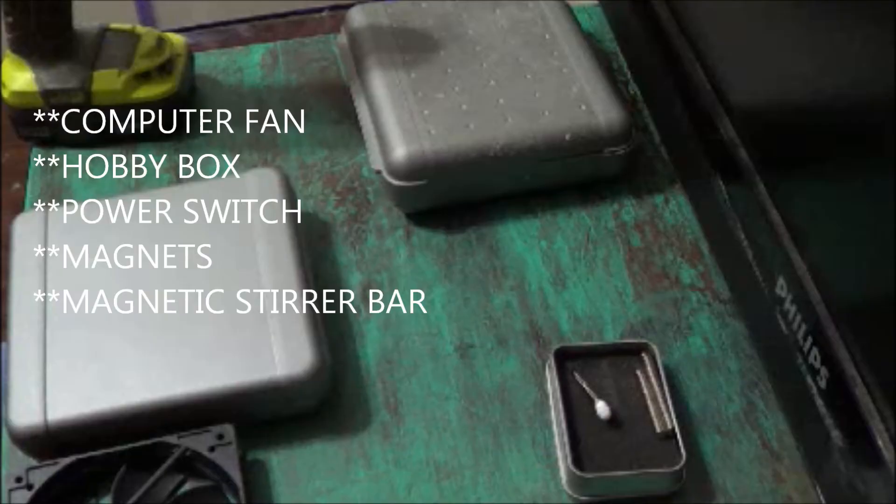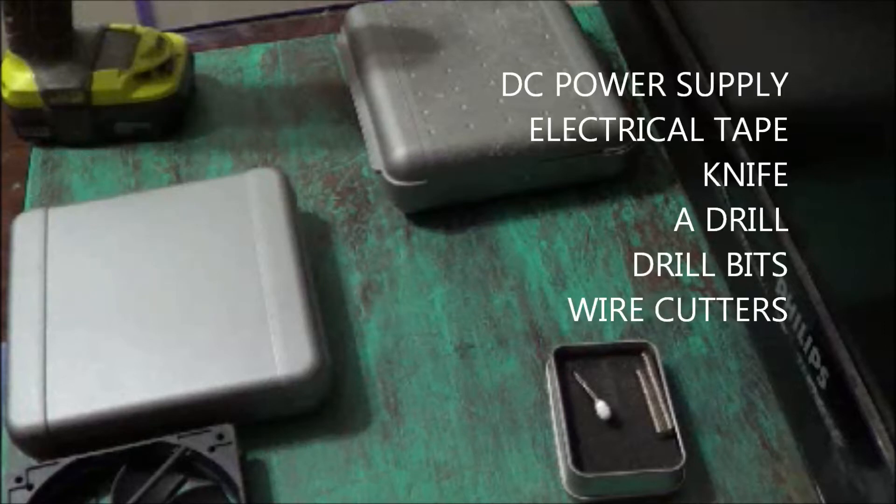Now to get started, some items that you will need: a computer fan, a hobby box, a power switch, magnets, and a magnetic stirrer bar.